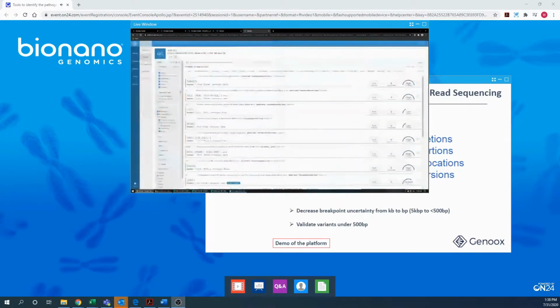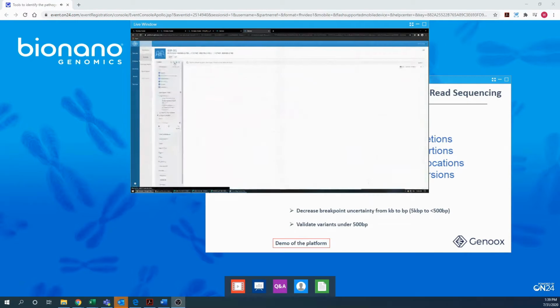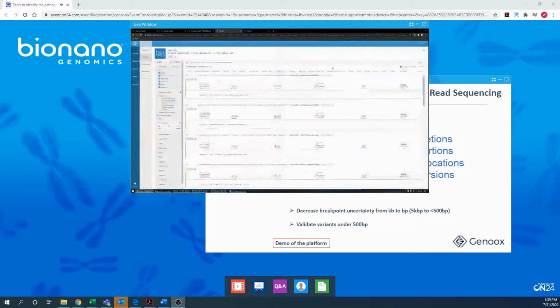So one additional thing I'd like to show is a new feature that was developed in the last few months. It's this tab, which I think I already have open here: compound single nucleotide variation and structural variation. What this allows you to do is avoid what we used to do manually: analyzing structural variations and short reads, and then seeing if there's a potential compound heterozygous variant present.